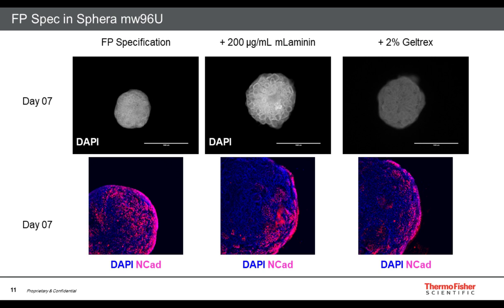We also looked at the structures by staining for the epithelial polarity marker N-cadherin. And we saw that extracellular matrix partially altered the distribution of N-cadherin into the lumens of these little bubbles or rosette-like structures. But it's not a completely black and white change.